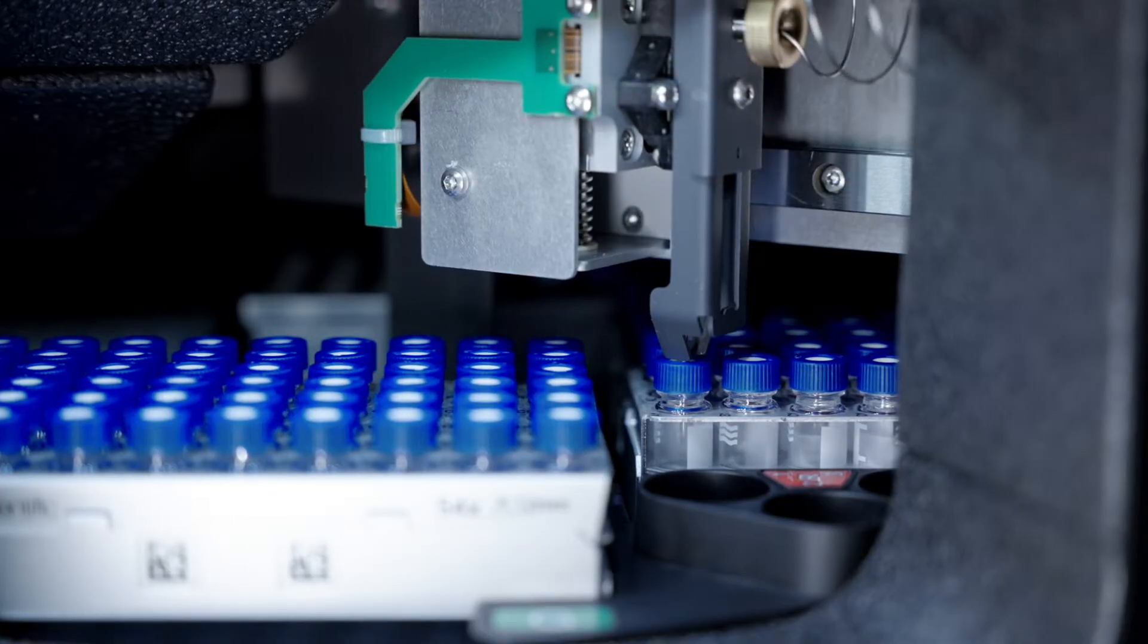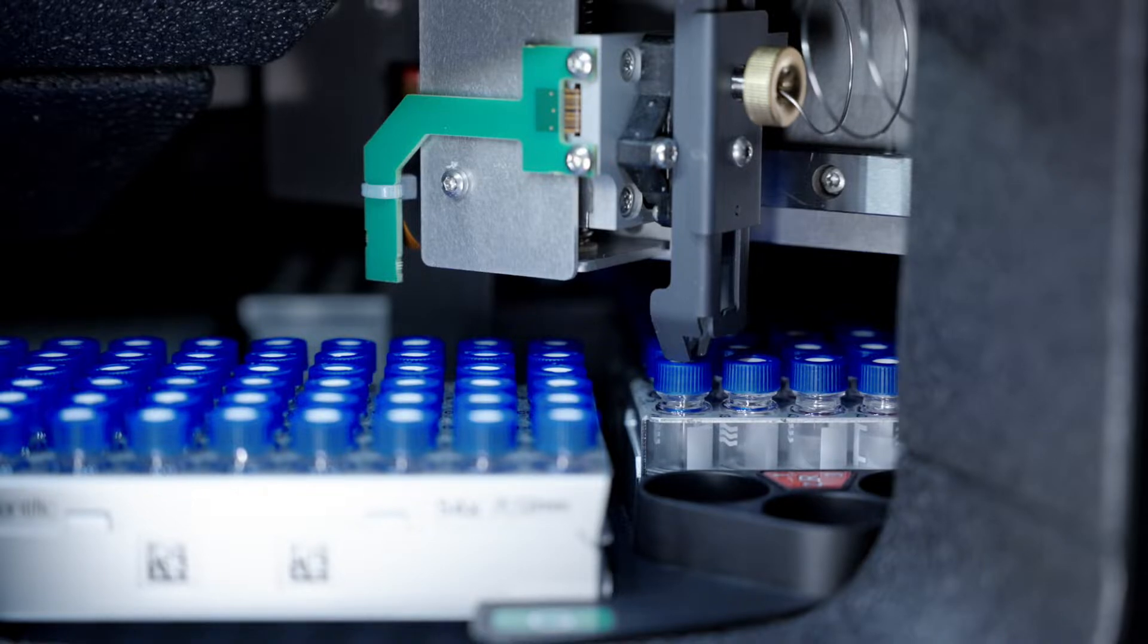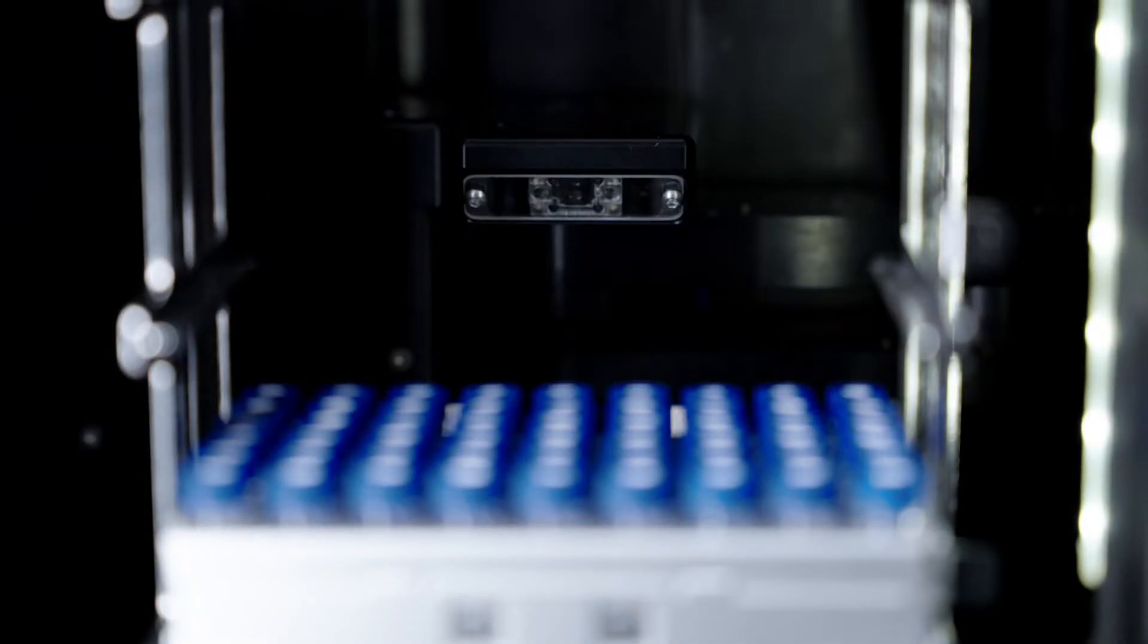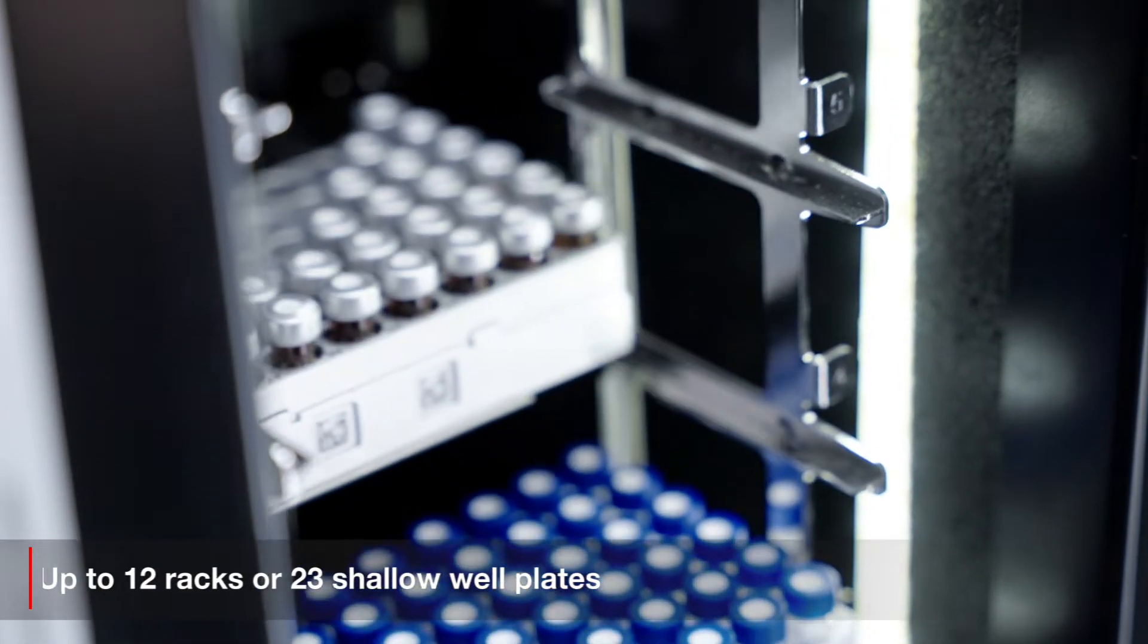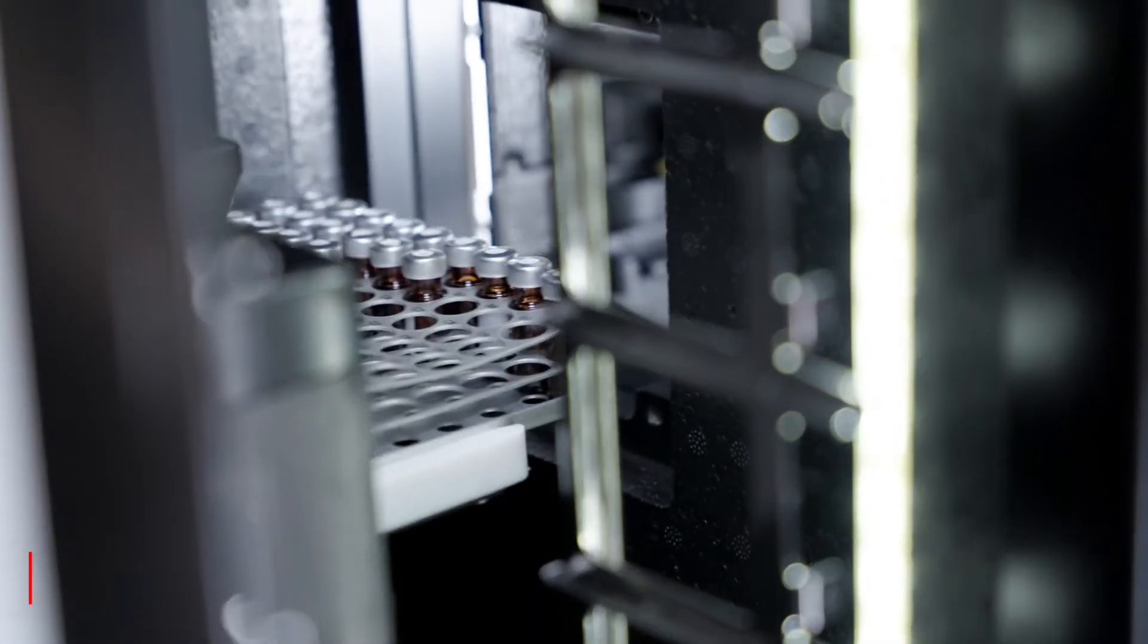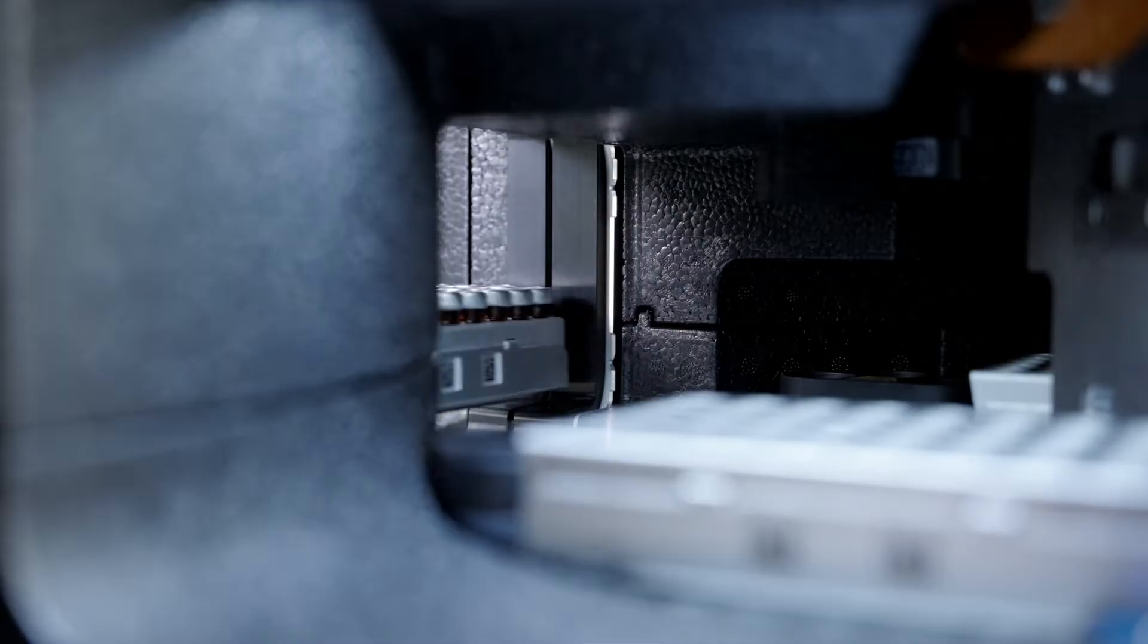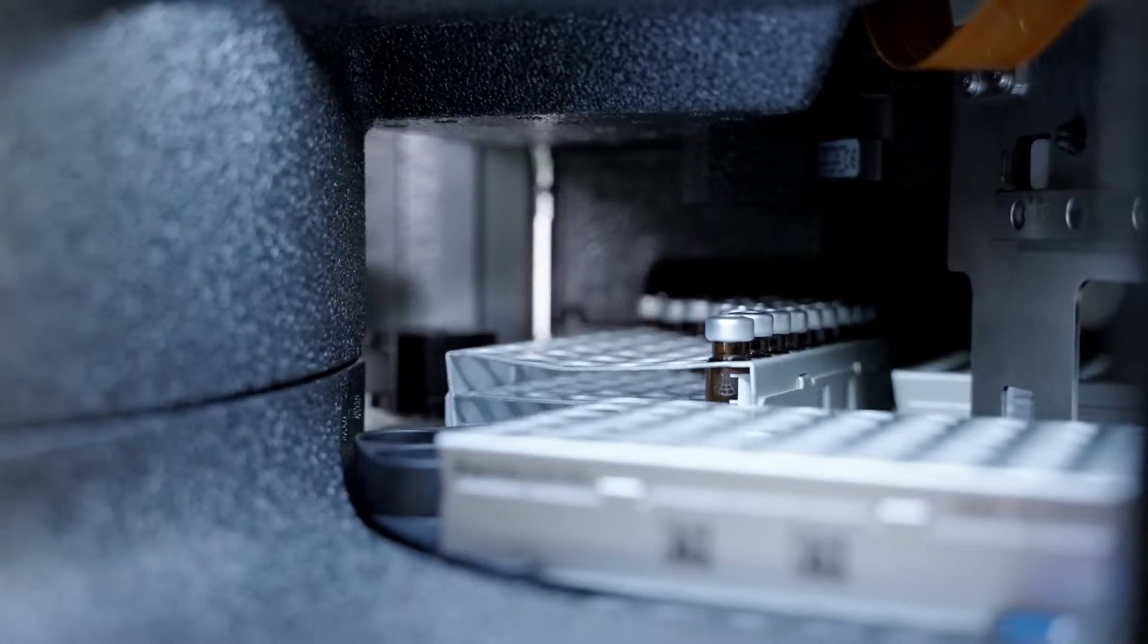Short injection cycle times and a minimized gradient delay volume are ideal for high-throughput analysis. The Vanquish Charger module extends temperature-controlled sample capacity for unattended analysis of large sample batches.